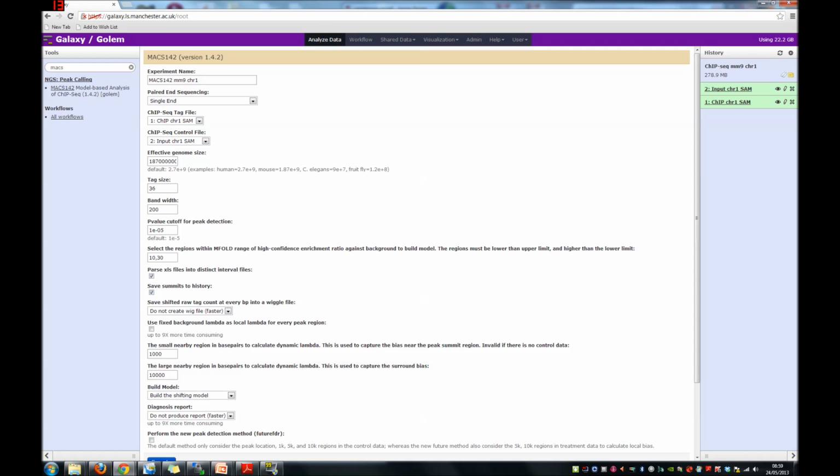Okay, this option here, you can pretty much leave that. This is to do with predicting what the fragment reads are in the sample after sequencing. And we want these two samples selected because we want the detailed output for downstream parts of the analysis. We also want to keep the wiggle output file.